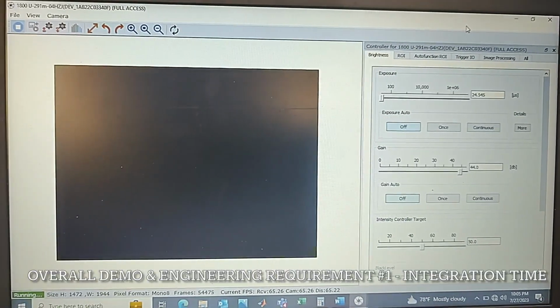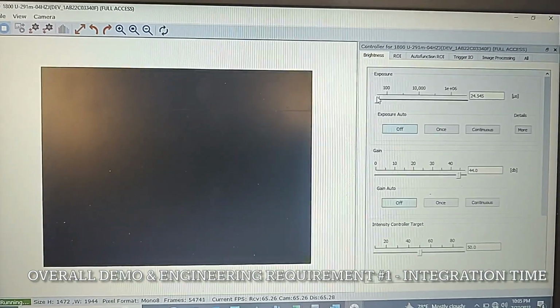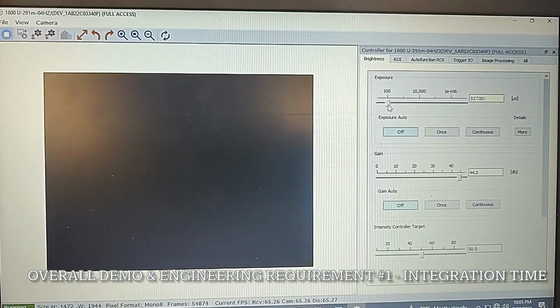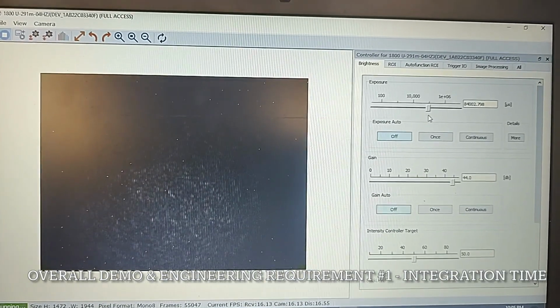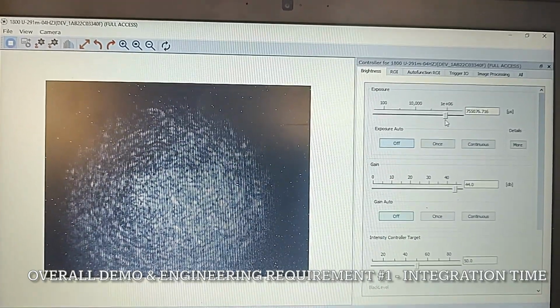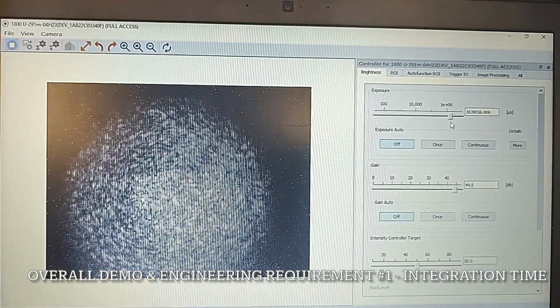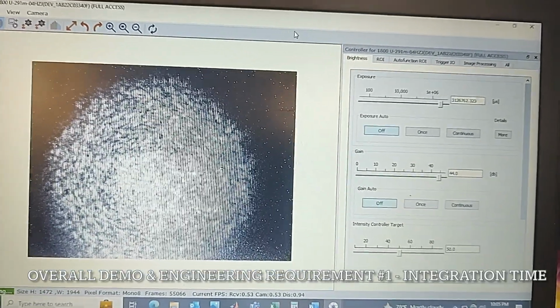Alright, so we have our Raman probe sitting underneath the chemical that we want to measure. So let's go ahead and up the exposure time until we get good visibility on the fringes that form by the SHS. Right now we're at about half a second, so let's maybe go up to 2-3 seconds. Okay, I think that might be good.